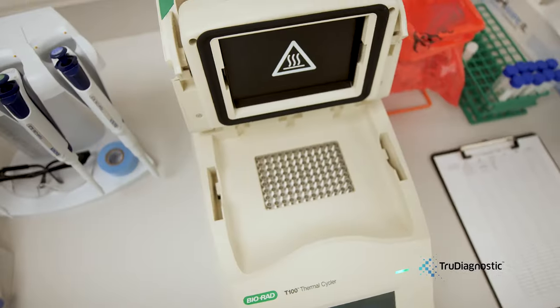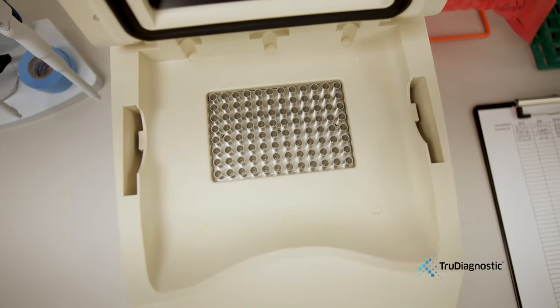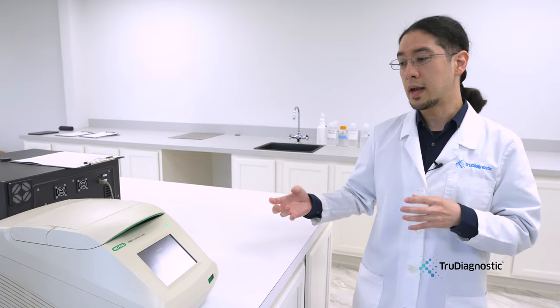The protocol removes the non-methylated cytosines and replaces them with uracils, allowing only the methylated sites to be scanned more efficiently. This process uses the thermal cycler machine here, which allows the temperature to go up and down very smoothly so that the conversion process works very efficiently.